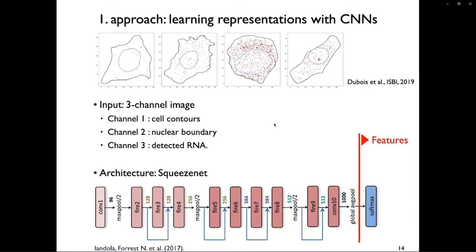The idea here is not to use the output of the neural network, but to look at the intermediate representation right before the softmax. This is a vectorial representation and should therefore be informative on the point clouds. This is the representation we then use, and you can project it to a low-dimensional representation and appreciate how usable this is in practice.